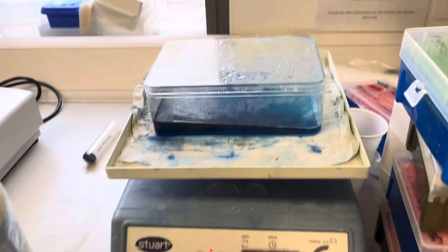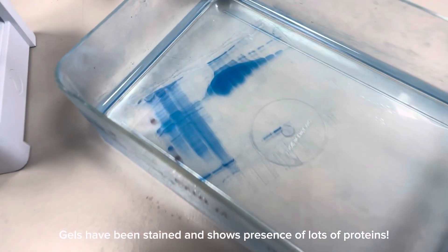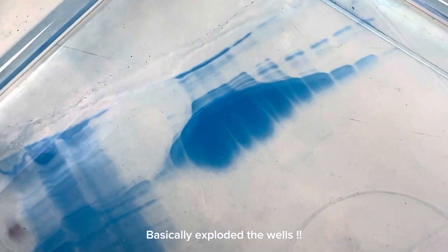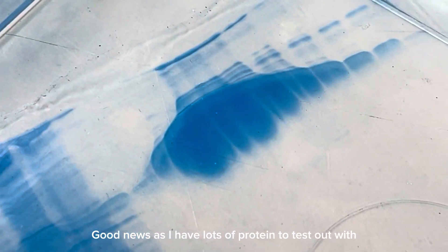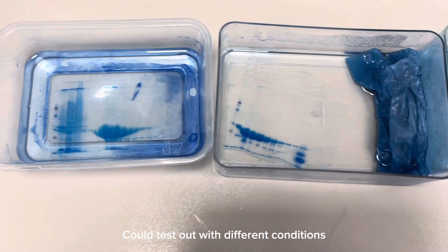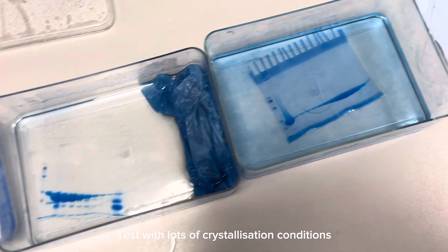The gel has been stained and it shows that I have so much protein that it basically exploded the well. This is really good news because it means I get to play around with lots of my protein — I can test them with different conditions and I can test with a lot of crystallization conditions.